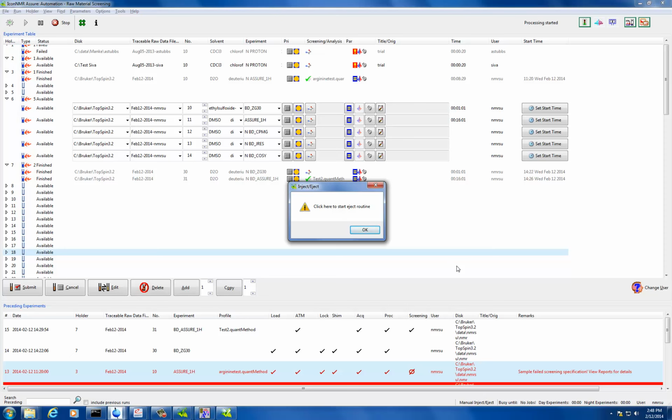I think this was one of the things that Kim mentioned to me a long time ago, that they wanted cranberry juice samples over in Germany for that purpose. I haven't heard anything more about it. But I could see why, because that's one particular type of juice, a juice concentrate, and that's what the profile looks like. But they could vary, for sure, because of processing effects. I think that's why it looks so different from regular cranberry extract.